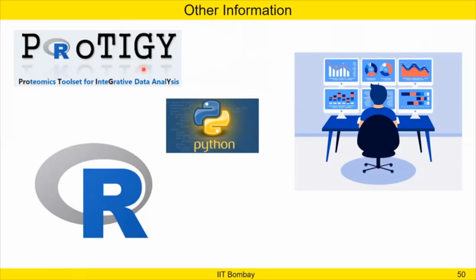But as most of you are starting analysis for the first time, we felt that we should start with a very user-friendly software, which is MetaboAnalyst, right?